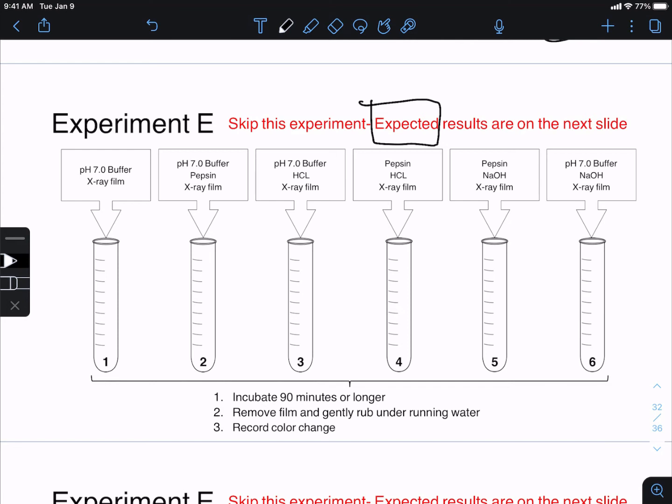One of the biggest problems is we actually use an acidic soap when we wash the test tubes. So it's a pretty good idea always to rinse out your glassware anyway, but it's also very common for the acid in the test tubes to activate the pepsin, and so you end up getting a digestion when you shouldn't. Regardless, I want you to notice how long this incubation is. That's one of the reasons I'm taking it out of the equation.